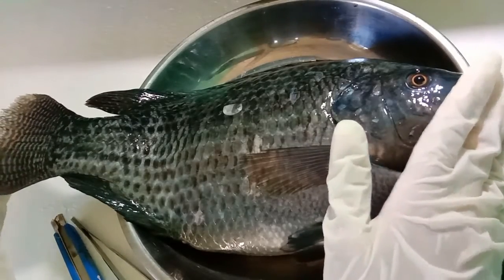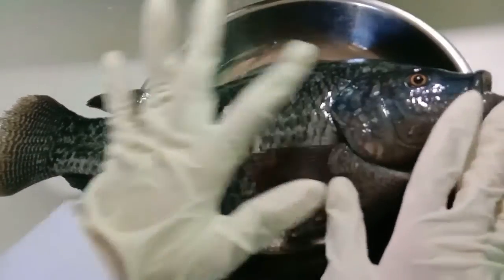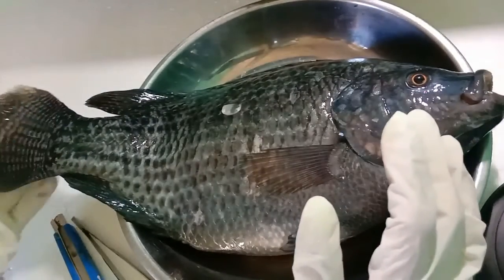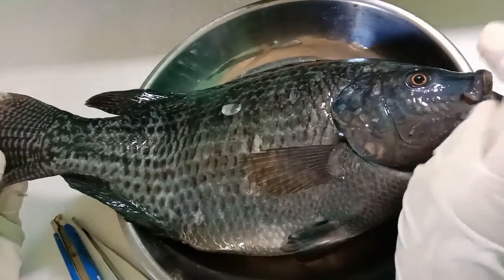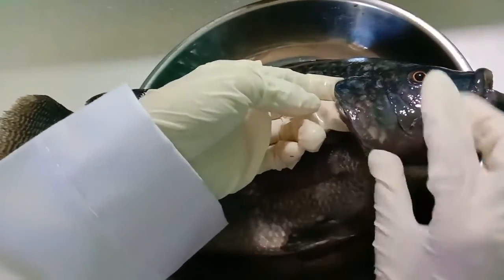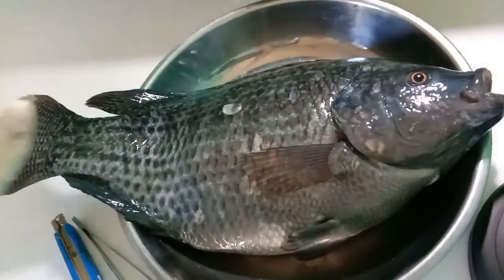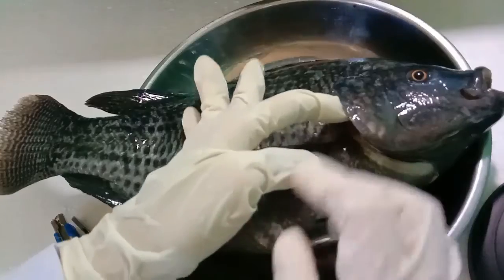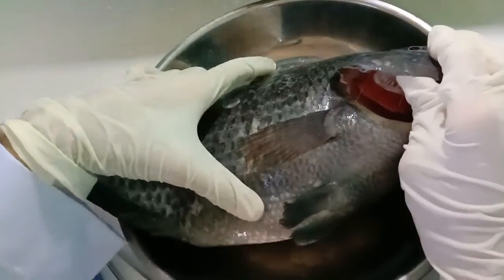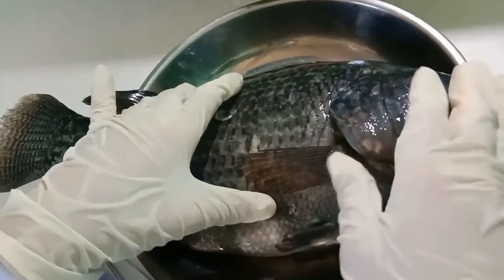Fish body is divided into three parts, namely the head, trunk, the body, and the tail. On the head, there is an operculum or gill cover. It's hard but flexible here. Its function is to protect the gills. Here are the gills, you can see. And it also plays a major role in the pumping mechanism.